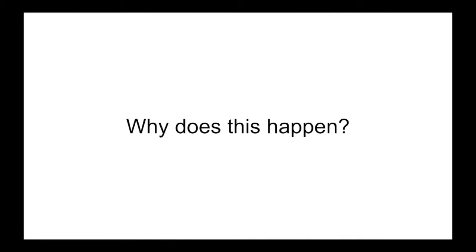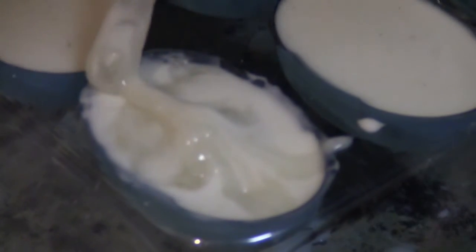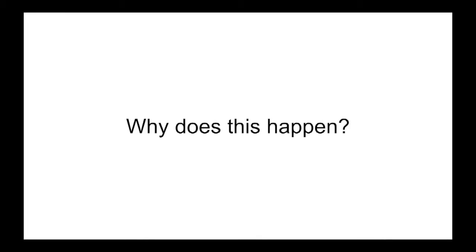Now, I think I know why this is happening. So this raises the question, of course, of why does this happen? If you look back at the footage, you can see that it has turned into a completely liquid goop. Which is actually a very good question. Why does this happen? I have done some research this morning. This is actually some older footage, so I've had plenty of time to research this. Here's what I have found.